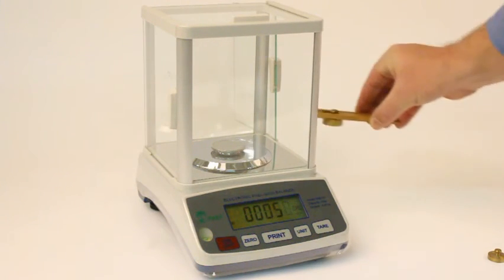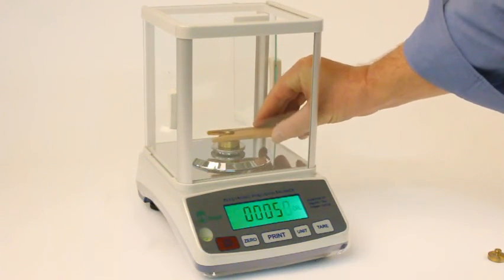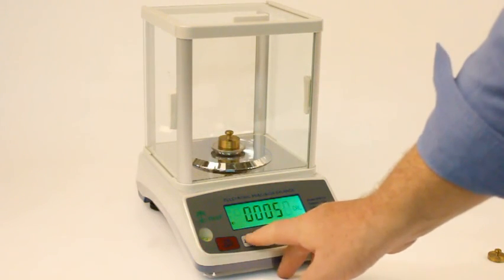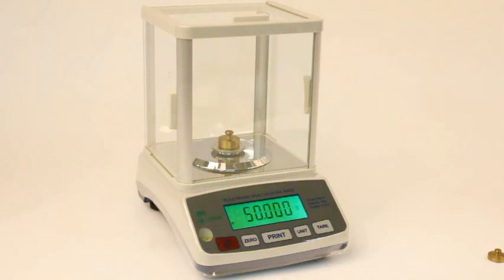Having done this, we simply put a 50 gram weight onto the weighing pan and confirm this with zero. The balance is now calibrated.